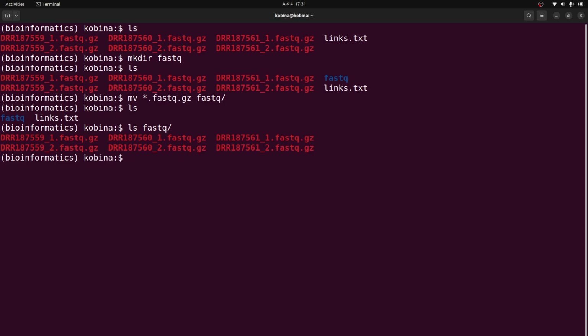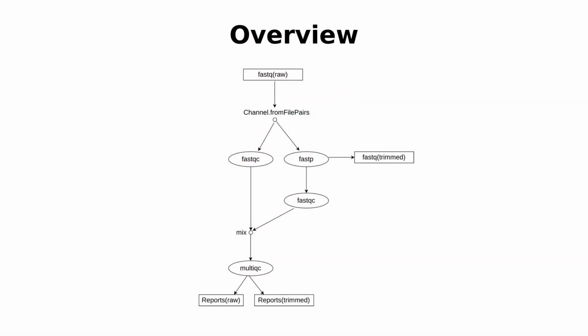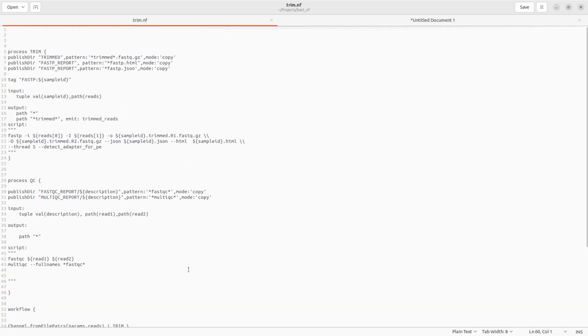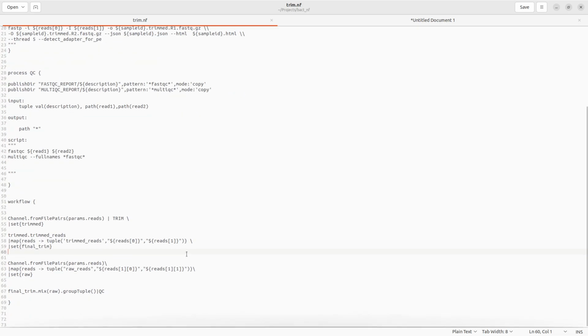All right, so we are going to start the Nextflow tutorial proper. I need to show the scripts. All right, so we have our script here, which we are going to use. For the sake of beginners, I'll go through this script step by step and explain a couple of things so that you can build on it later.